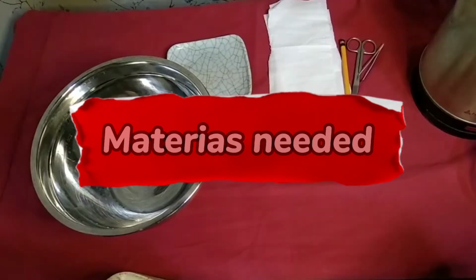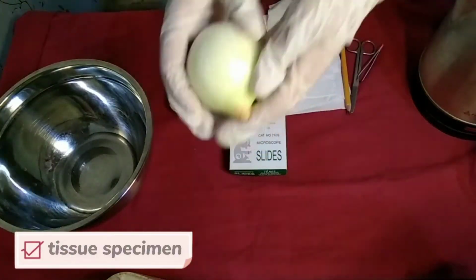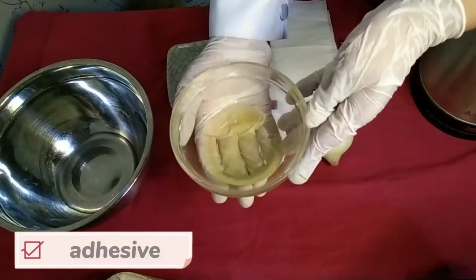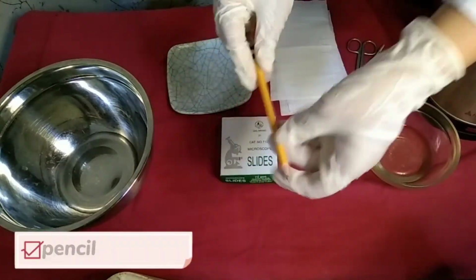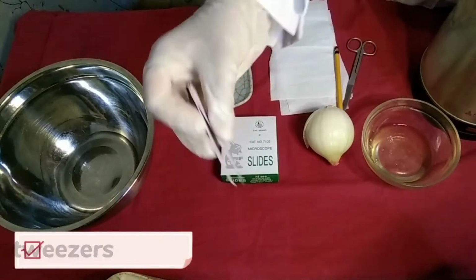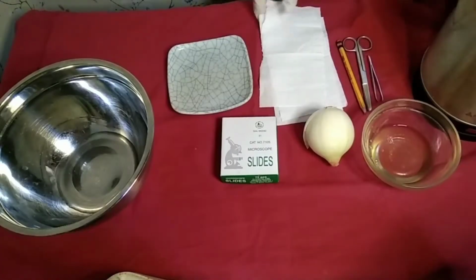Good day everyone, I am Ella Ortega from BSMLS 2I. So after embedding, I am now going to perform the floating out and fishing out of tissue sections. The materials needed in this procedure: we have here a water bath, tissue specimen, adhesive, glass slides, pencil, tweezers, scissor, and the paper towels.